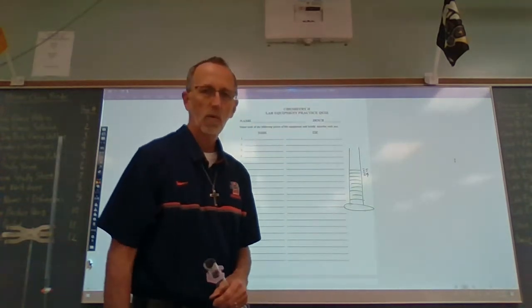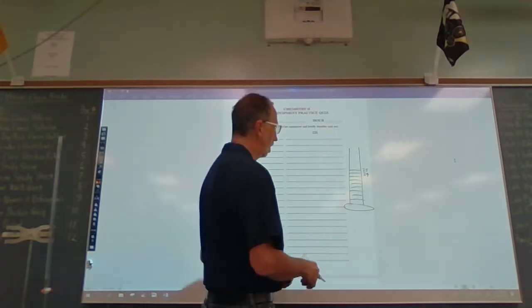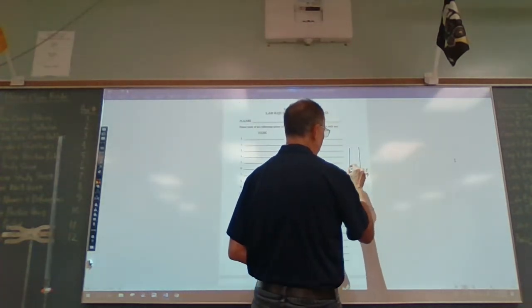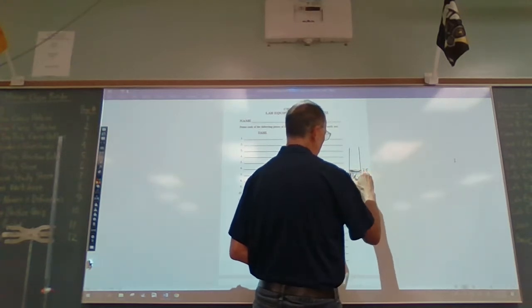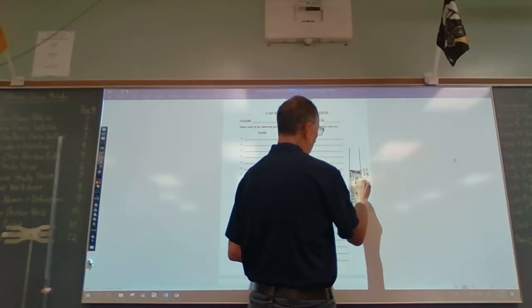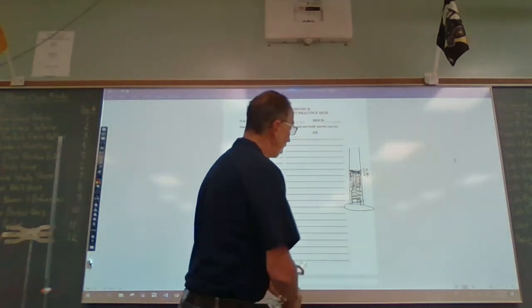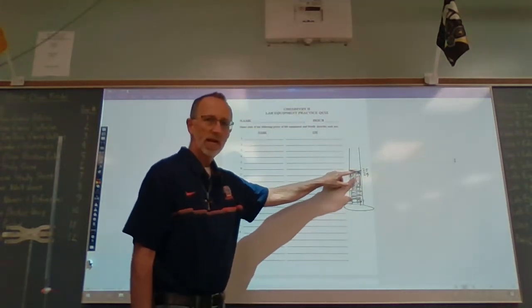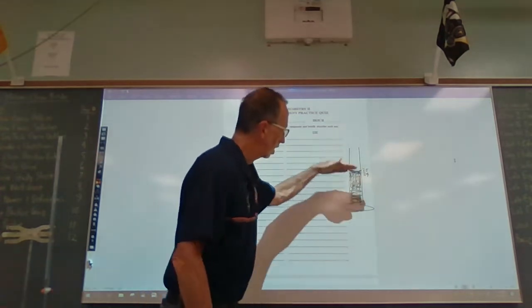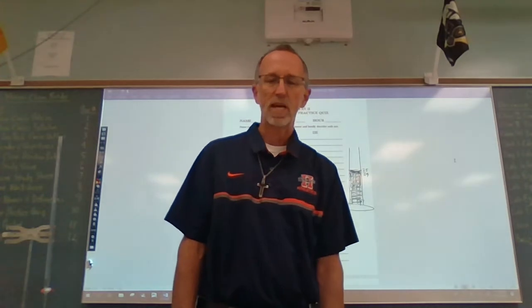Well, we put a liquid in here, whether it be water or some other liquid, and it goes about like that. You probably noticed this before because I'm sure you've used a graduated cylinder before, but that liquid does not lay in a graduated cylinder flat. It curves down like so. Anybody know or remember what that's called? If you said meniscus, you're right.